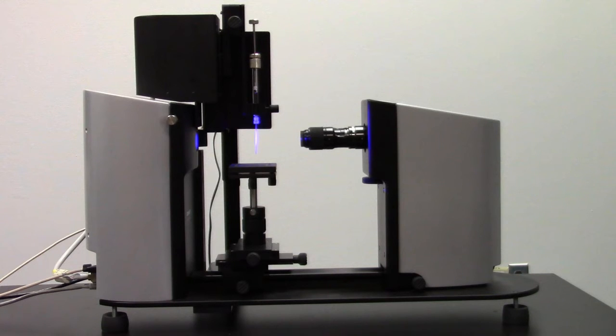To help differentiate whether the calibration is inaccurate or if it's because the system isn't clean, we offer a calibration verification kit. This is essentially a glass slide with silhouettes of standard, pendant, and sessile drop systems. You measure the silhouettes as if it were your sample, and you see whether you got the correct value using your calibration.